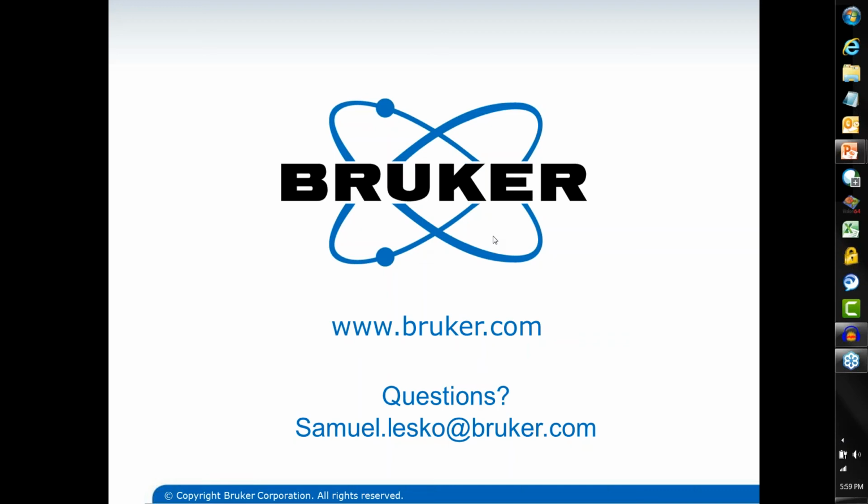Is data from the old Vision software compatible with Vision 64 software? Absolutely. We made it compatible both ways. Vision 32 saves data sets in OPD format, and OPD format is fully recognized by Vision 64. Furthermore, Vision 64 saves OPDX, which is a new file format, but we can still save the OPD file format, which means people having a database of 10 years of data collected with OPDs who still want to make performance analysis with Vision 32 can still do that. They will just acquire and save data through Vision 64 and then port that to Vision 32.